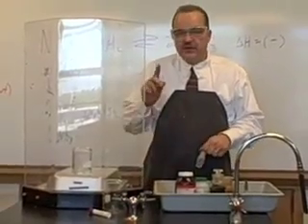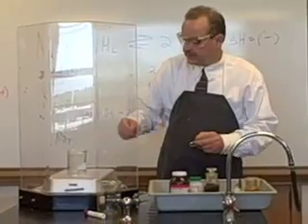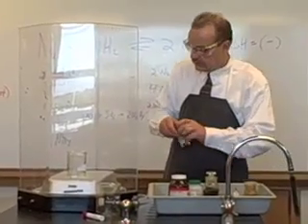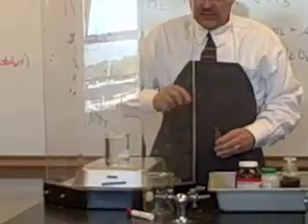All right. I'm adding a couple of pieces of magnesium to the water. We're going to see over a period of time if anything happens to the magnesium in the water. We're just going to let it sit there while I do the rest of these demos.